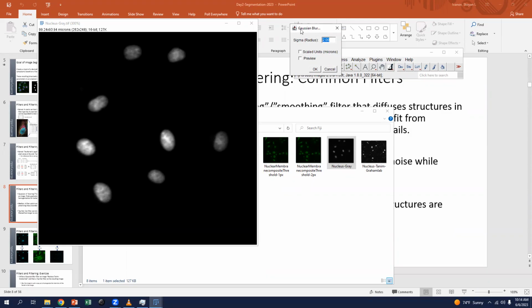So always keep your raw data and always keep track of what filters you apply and how you've applied them, because that information is very important at the very end when you're going over your analysis and determining its accuracy.